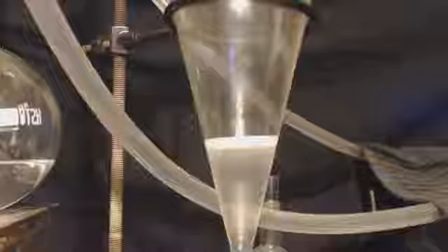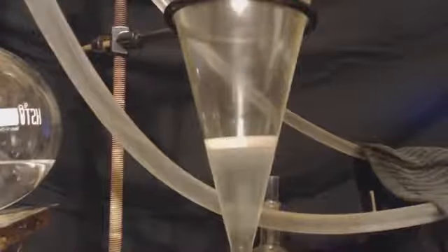As you can see over here, this is in this separatory funnel. That's stuff that was left over from where I cleaned off. You know how I kept dumping the water in? Well, that's the water there. And there is a little bit, you can see there's a top layer there. And so there's obviously some more non-polar stuff in there. Look how I can't get the soap out of there, though. No matter how many times I dump water in and take the water out, it will not get rid of that soap. But watch this.